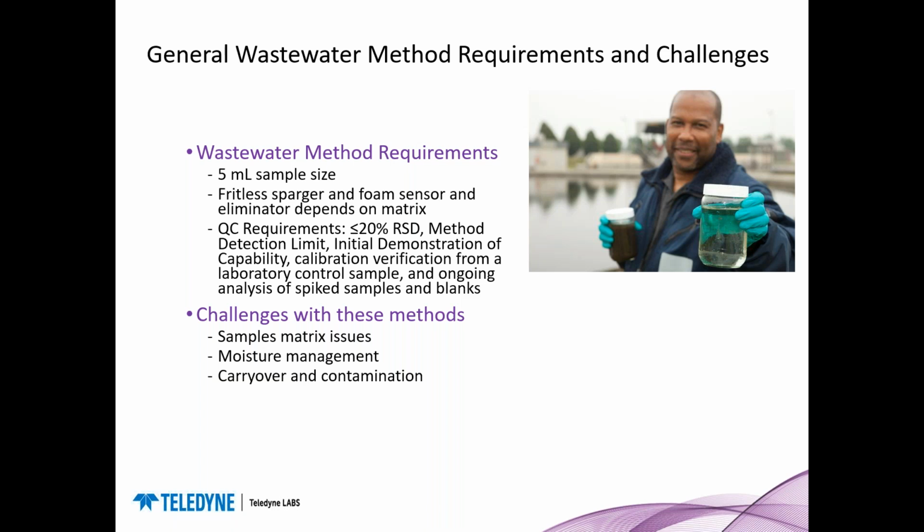But there could also be semi-volatile compounds in that sample that can build up over time in the gas pathway as they're purged out of the solution, and then they're deposited inside the purge and trap system. As these start to build up in the gas pathway, the parts of the system we don't normally consider a consumable can cause active sites where reactions can occur and cause adsorbents, where some of the compounds of interest could get stuck or hung up, and they could be re-released into the next sample or the sample after that, or they could just make compounds disappear altogether, and we see a suppression of the actual concentration that's being passed on to the detector. So we really have to be careful what we're purging into our system.